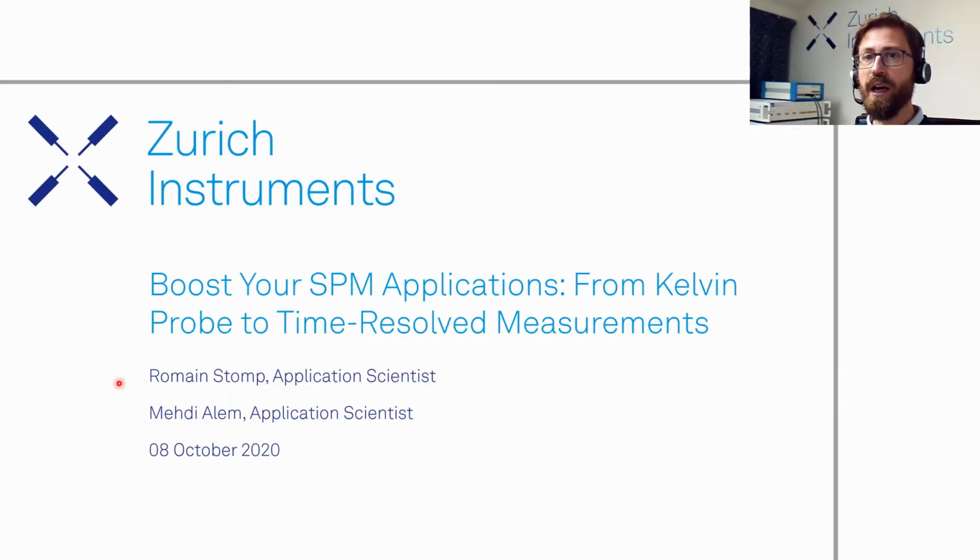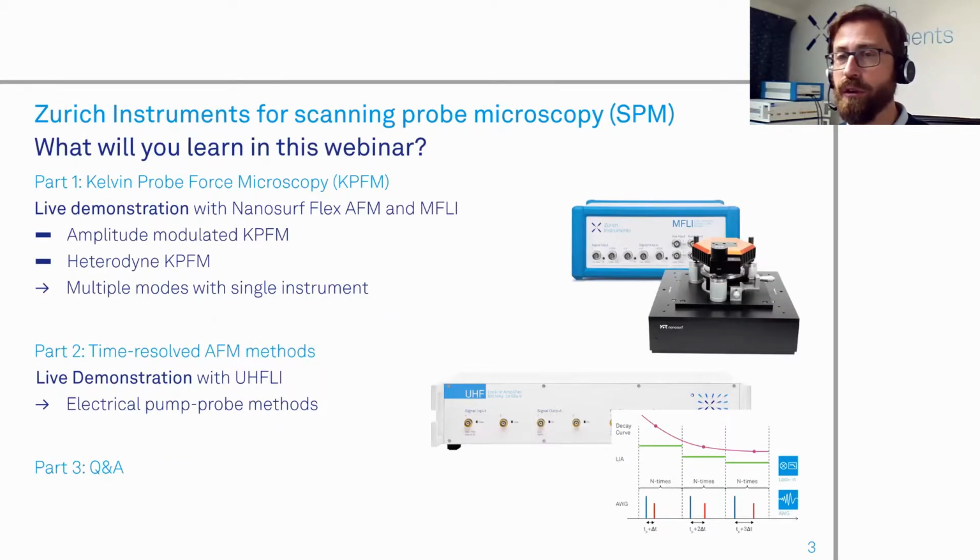Okay, so we have a very busy hour in front of us, and this webinar will be split into 3 parts. We'll get started with the KPFM part, focusing on single pass techniques and how to apply this to amplitude and frequency modulation mode. This section will take the bulk of our time, as we want to be as concrete and practical as possible with demo on a real setup. This will then be followed by the presentation and demo from Mehdi on electrical pump probe method, therefore in a more time resolved approach. And we'll keep, of course, some time at the end for the Q&A session.